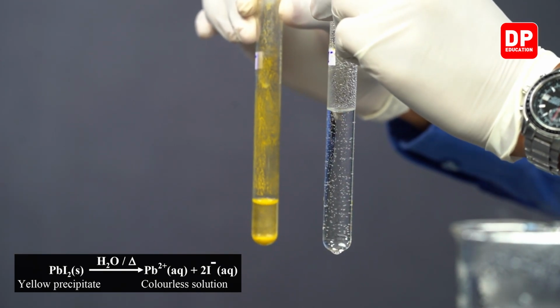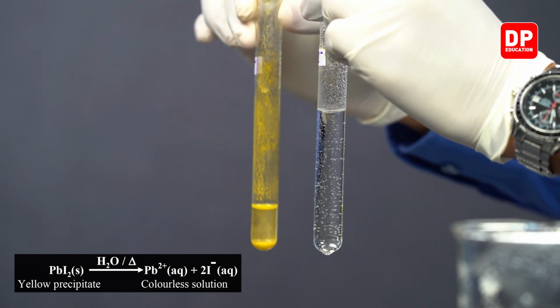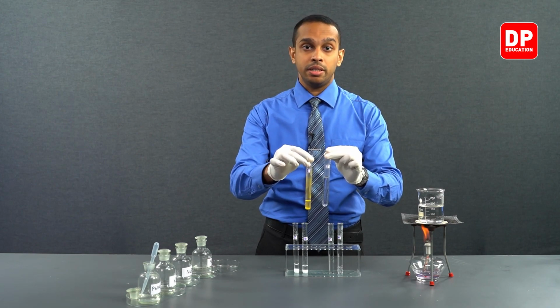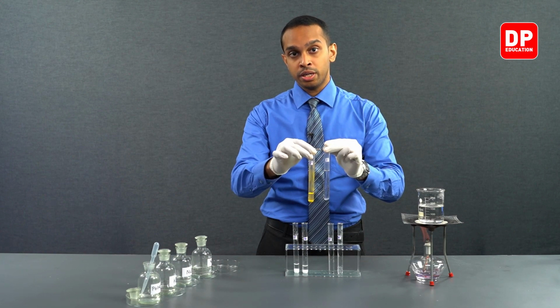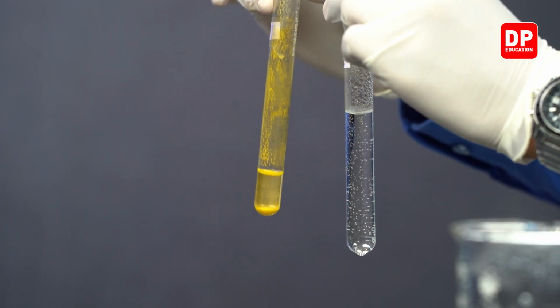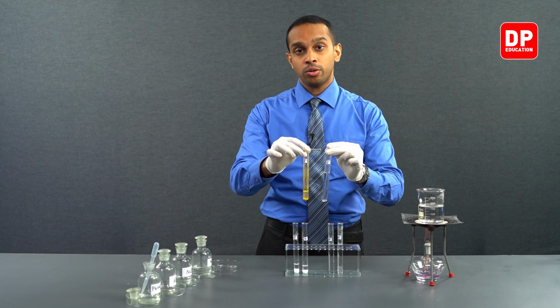You do not see a yellow color in this hot solution because all of the lead iodide precipitate completely dissolved to form a clear lead iodide solution in hot water. So this is evidence that lead iodide precipitate can dissolve in hot water.